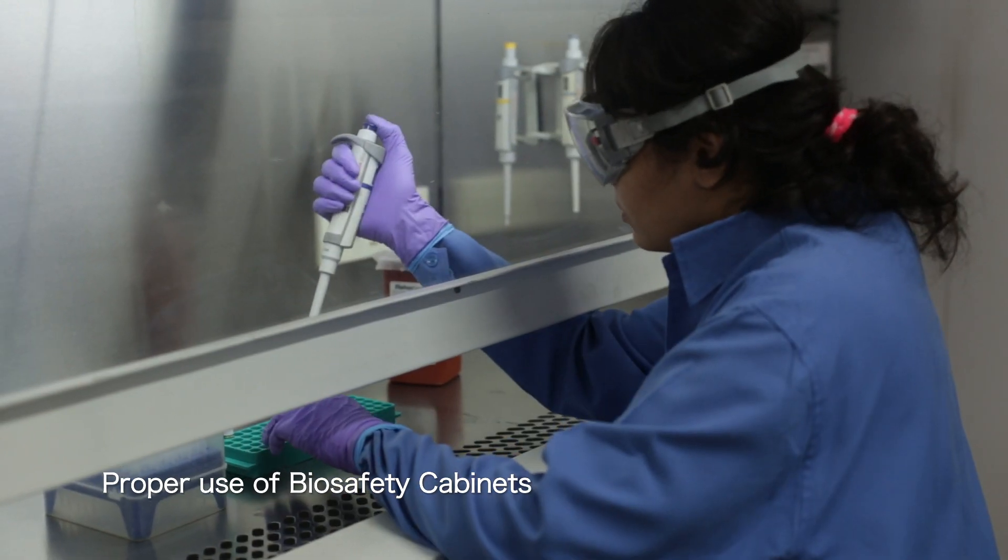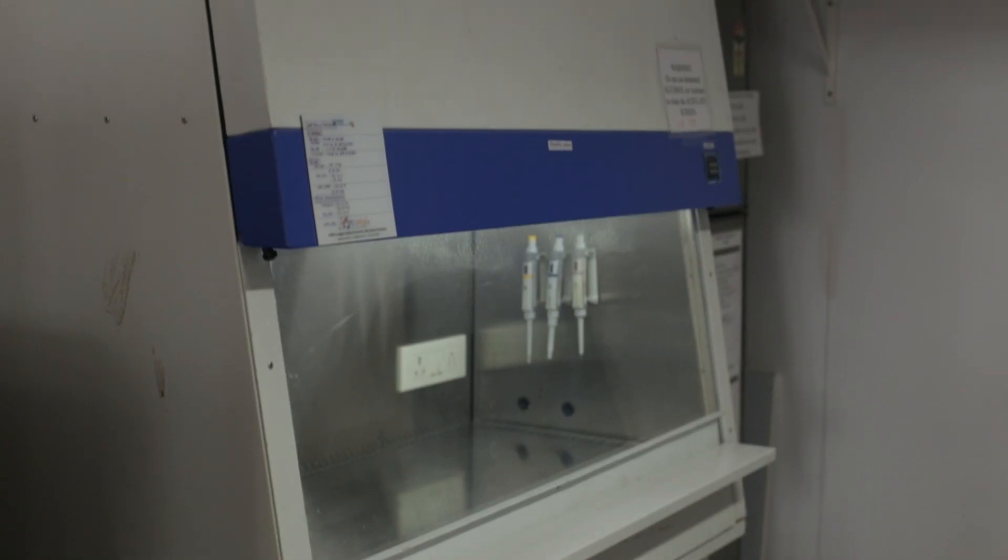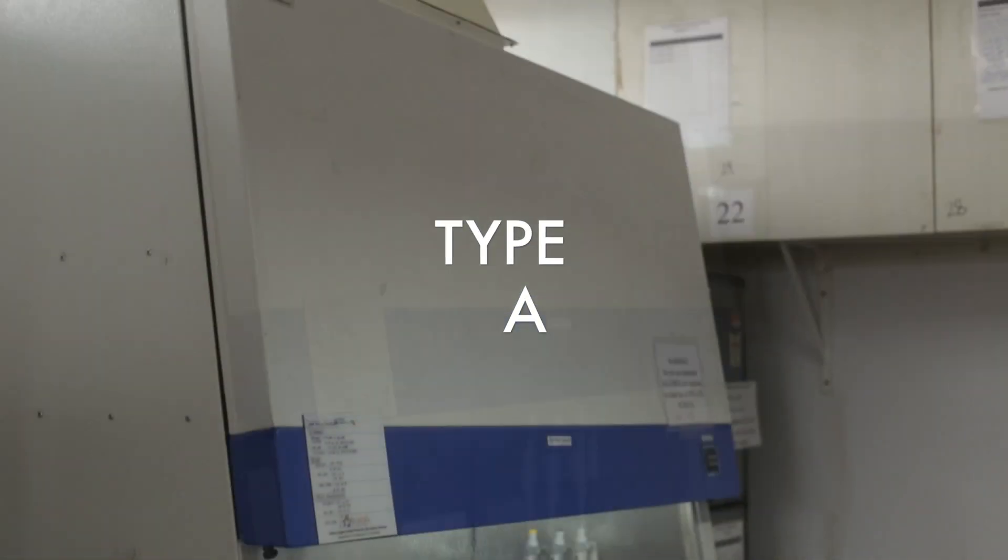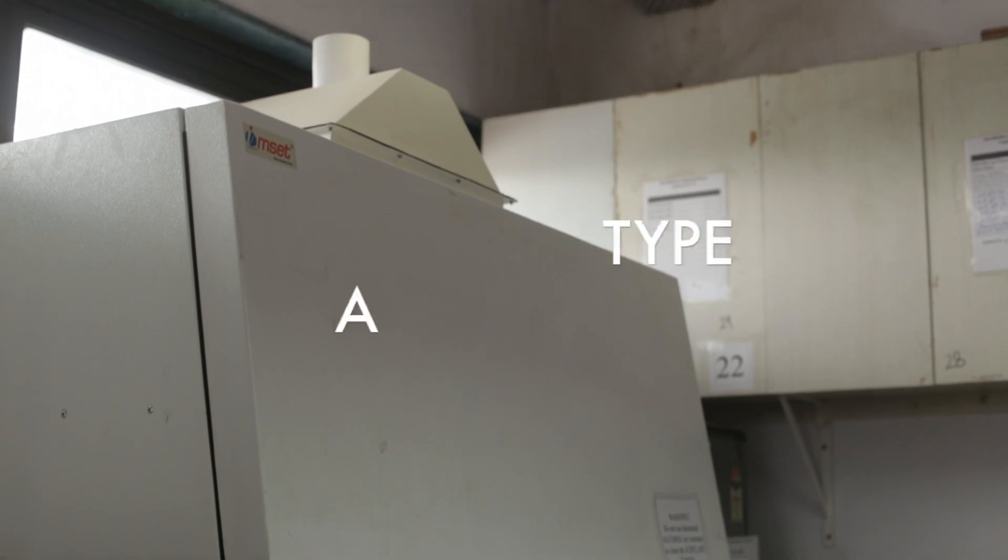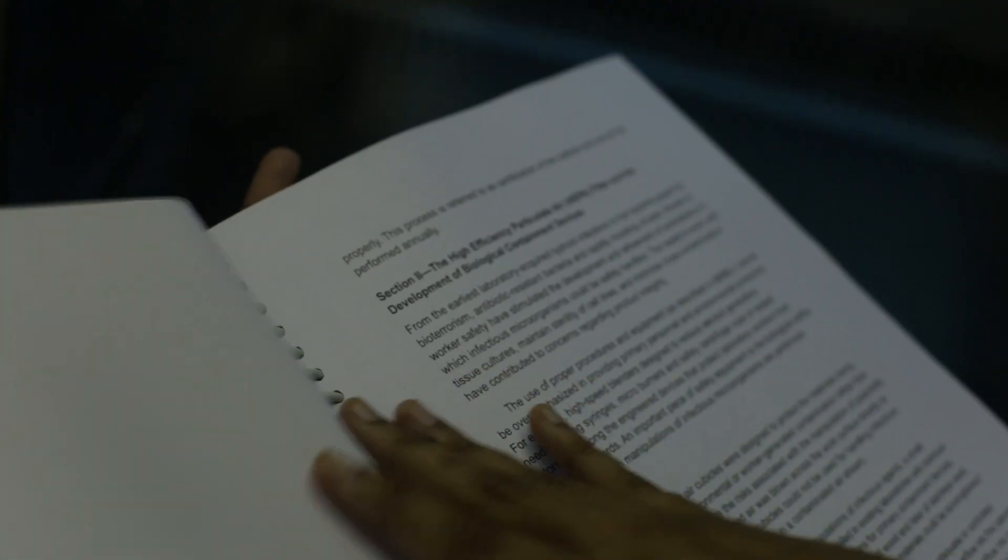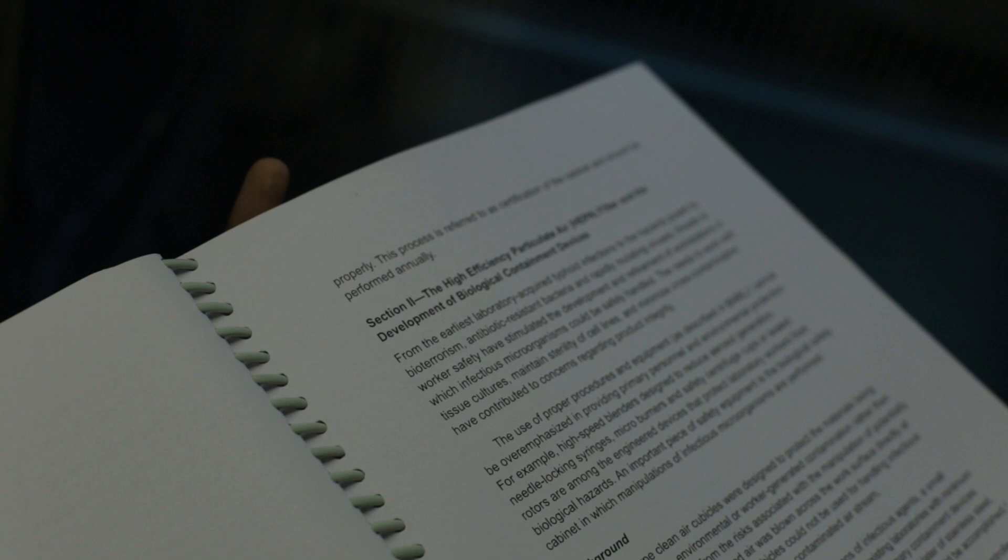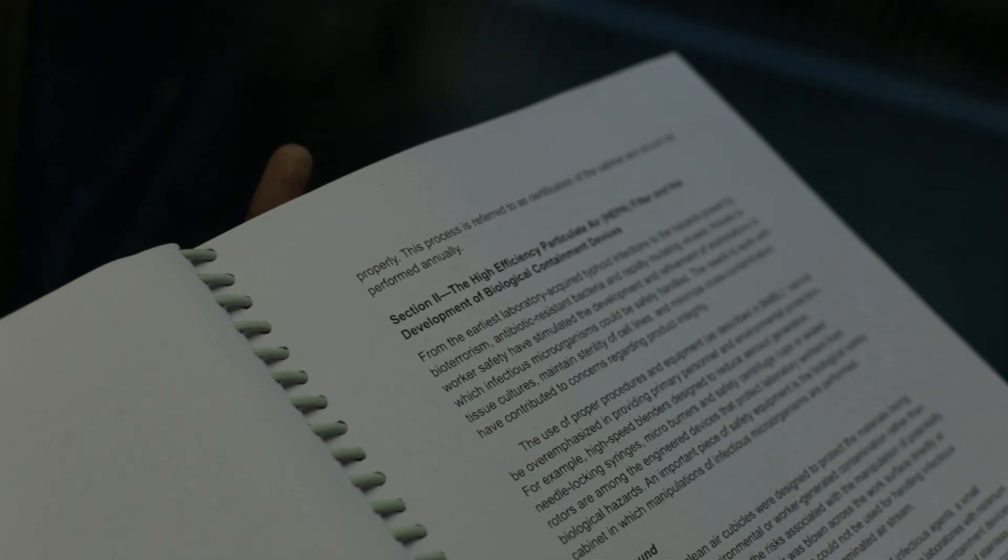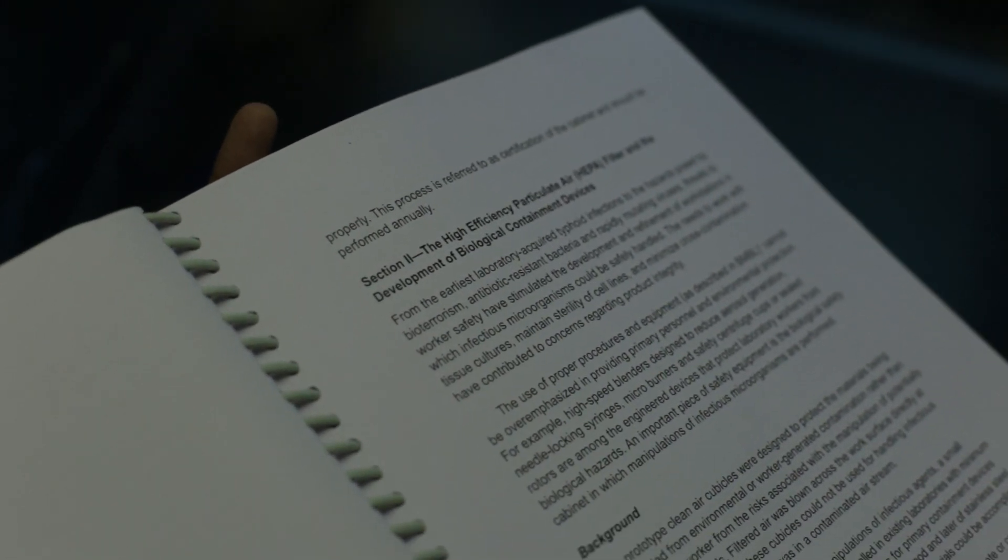Biosafety cabinets offer protection from aerosols and splashes and prevent contamination. The biosafety cabinets which are commonly used are the Type A and Type B. Before working with a biosafety cabinet, make sure that you are familiar with the proper operation and safety precautions by referring to the user manual.